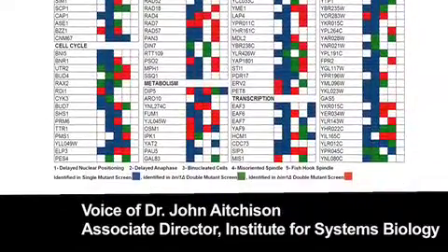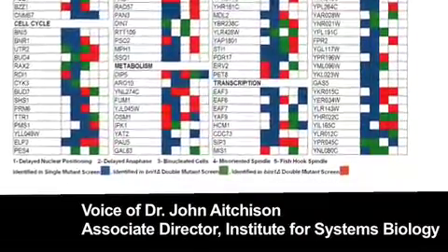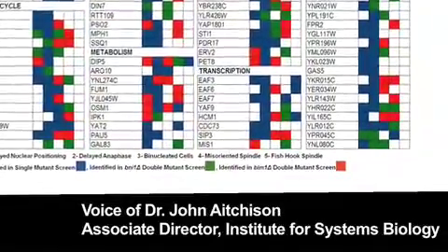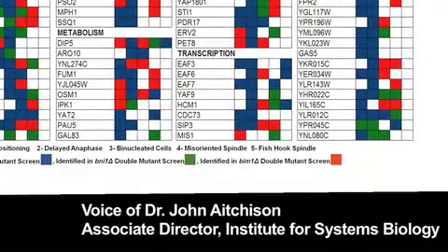And you can identify combinations of mutants that lead to very similar phenotypes, and in this case, the one they focused on was these fishhook type spindles. And so by that you can directly see that each of these genes are likely involved in one specific aspect, and that is the formation of a normal spindle.